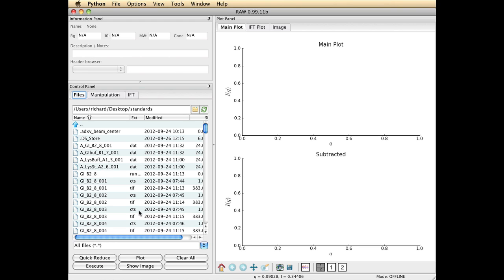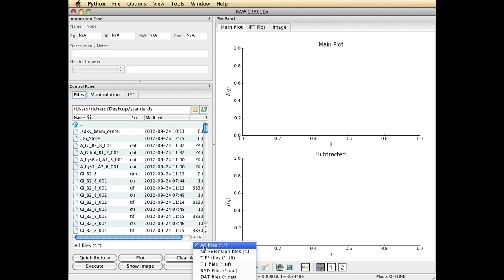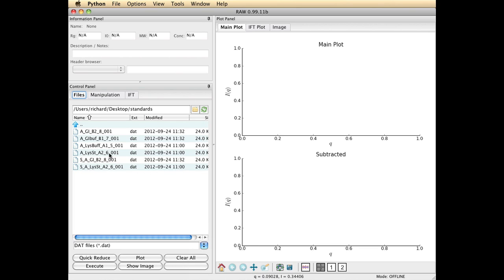I'm just interested in the .dat files because those contain scattering profiles that have already been computed. So I go down to the all files line here, click on the icon and choose .dat files and that's a filter that allows me to just see .dat files. That's exactly what I want.